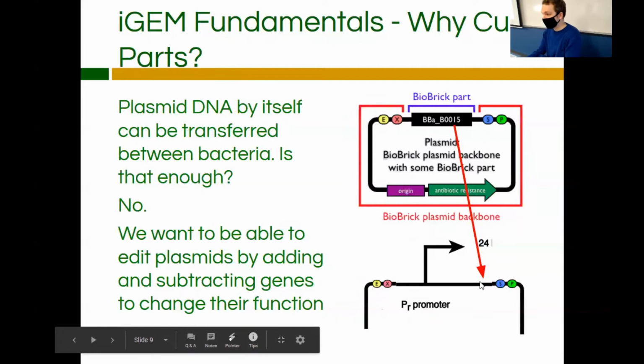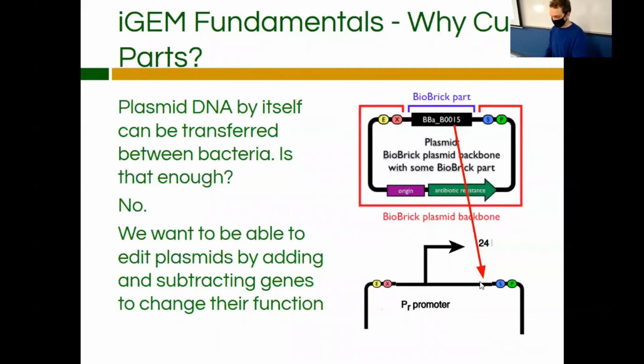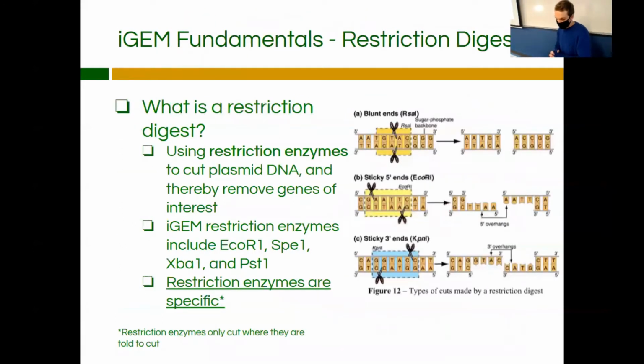So how do we do that? We're going to have to use digestions. Restriction digestions is using restriction enzymes to cut plasmid DNA and thereby remove your part or gene of interest. iGEM uses specifically 4 different types of restriction enzymes, those being EcoR1, SpeI, XbaI, and PstI. There are more enzymes that they use overall. We have a few more enzymes, but these are the ones that they predominantly focus on because they're the easiest to work with.